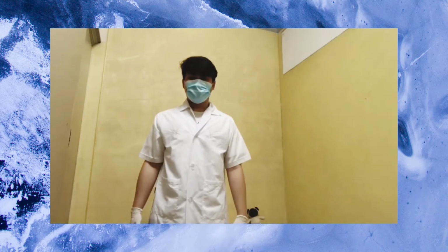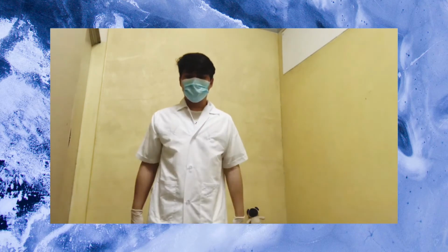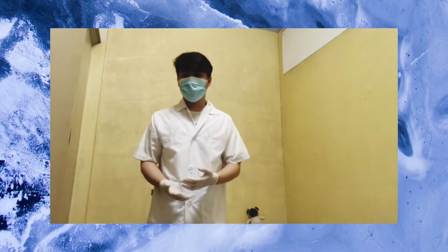As you can see, I'm wearing my lab gown, my face mask, and a pair of sterile gloves. It is also necessary for you to wear your lab shoes in the laboratory. For girls, it is a must that you wear your hairnets at all times.